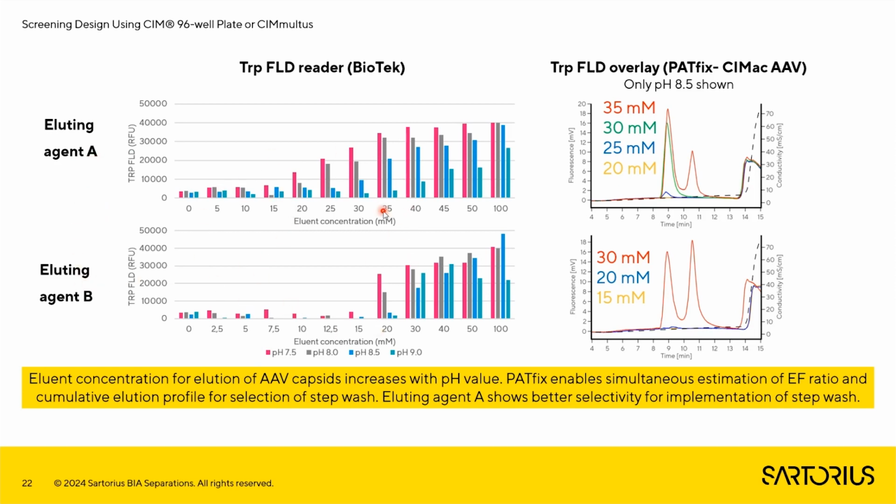If we focus first on the microplate reader, what we see is color coding: the different colors represent the pHs, and below we also see the eluent concentrations.